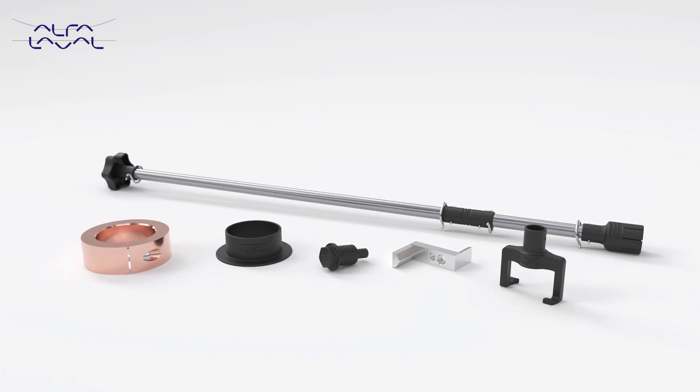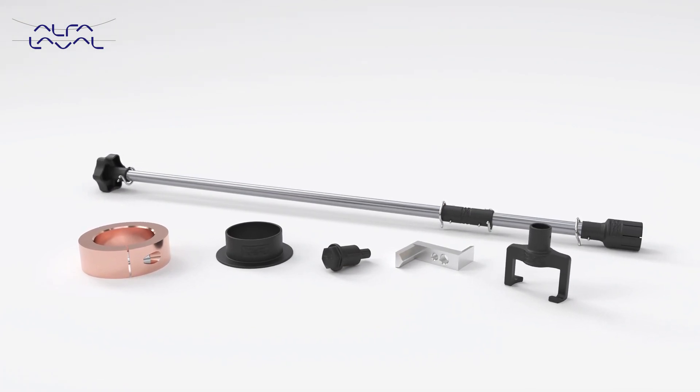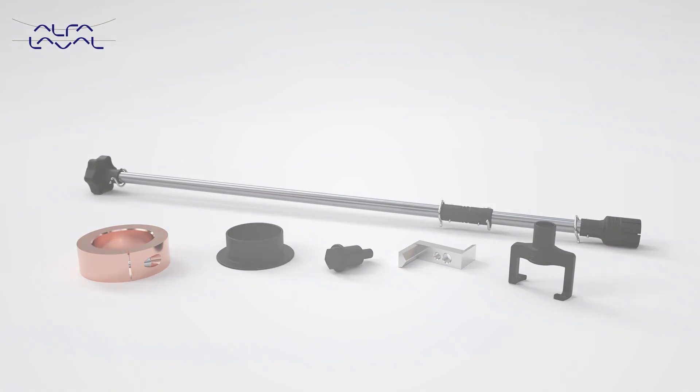impellers. Tools for easy maintenance are also available. Patented impeller design ensures optimized flow.